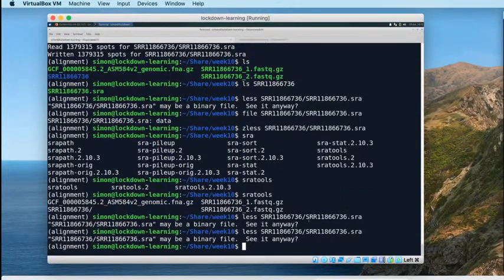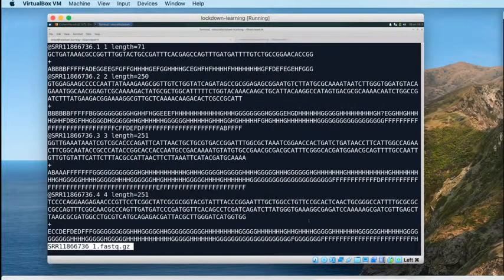That's a little that failed completely, so sorry about that. But we do have FastQ files, and we know that they're gzip compressed text. Because it's paired end data, and we told fastq-dump to split out the pairs, we end up with two files. In each of those files, we have one of each of the pairs, and it looks like this.